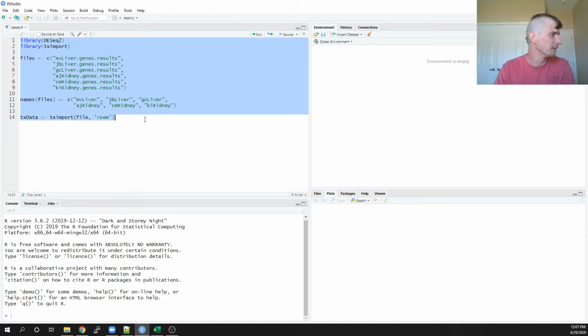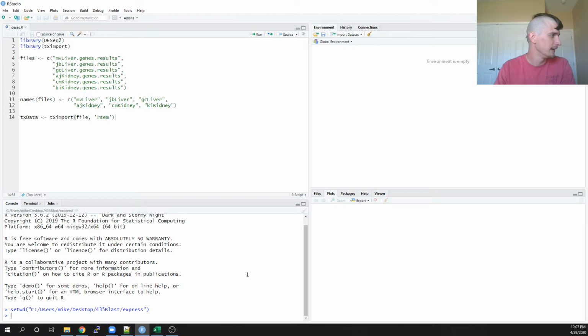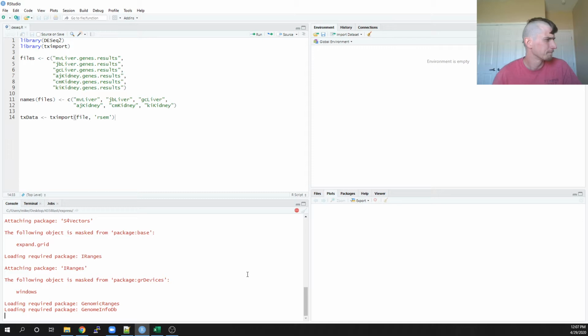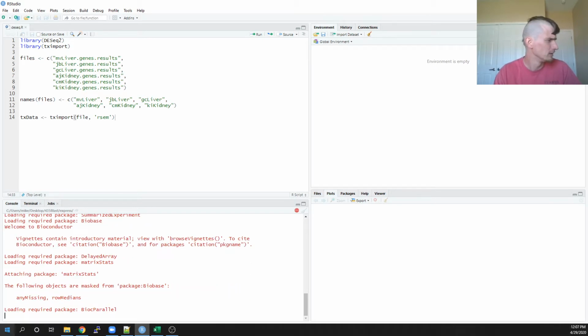So I'm just going to have all my commands. Make sure that my working directory is set to the appropriate one and source this, just what I've written down already. Make sure I don't have any problems. So it's loading up these packages. No major complaints yet. Still no major complaints.